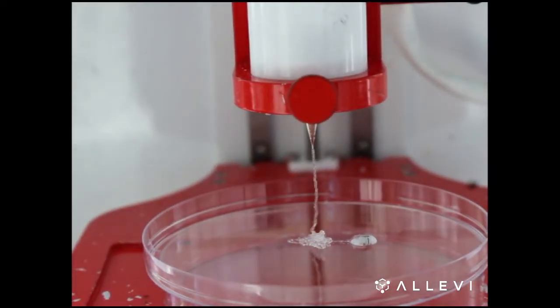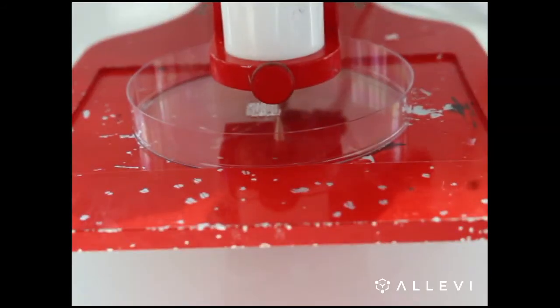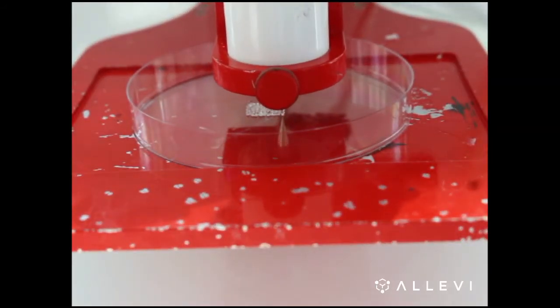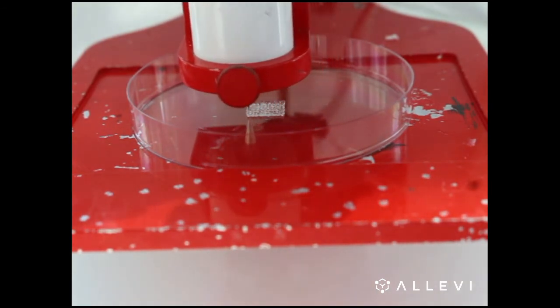As you can see, GelMA extrudes evenly, although it has a large deviation in resolution. Again, in printing a two-layer lattice, you can see even extrusion with a resolution of about 300 microns.